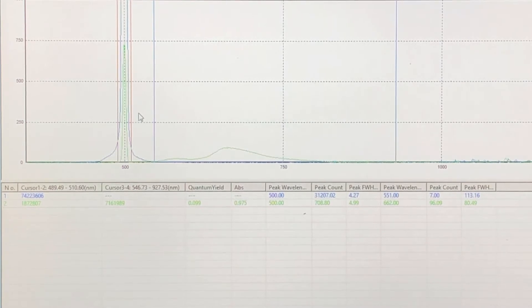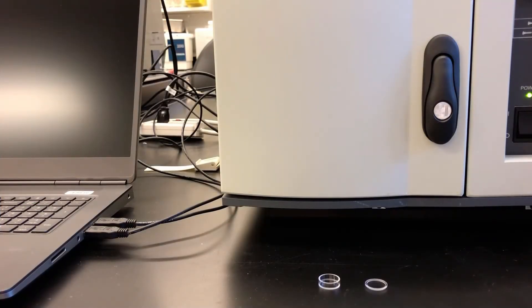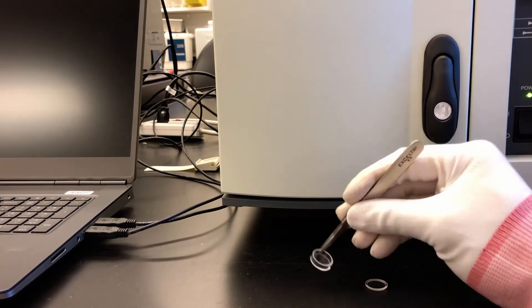Our scan is complete. Before we finish up, I'll mention a couple of other sample types you might be interested in.